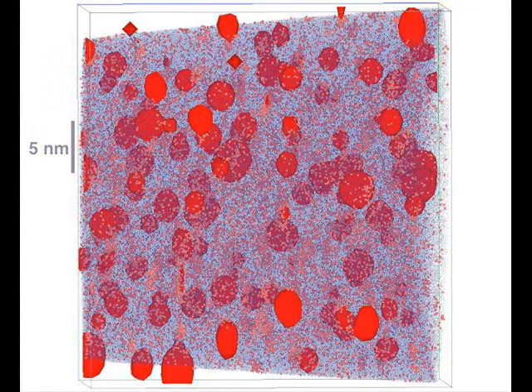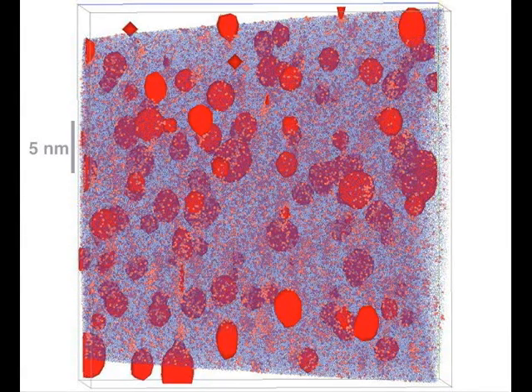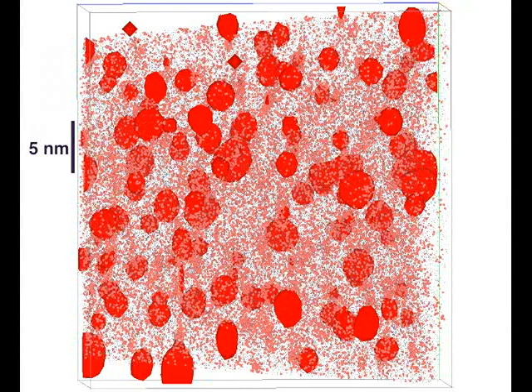Of course, if we leave the iron in, we won't see them, so we'll take them out and do some visualization. For reference, this is 2.5 million atoms.